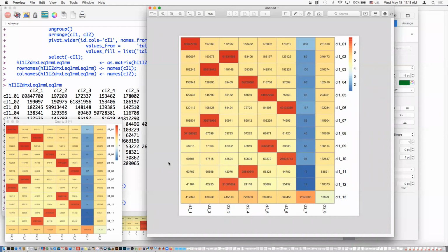It means I only know the I1 identity of the sample. That's like knowing only the row number. I do not know the column number, which means that in a demux analysis of I1 alone, what goes out in a demux pile is the entire row, right? The entire row for, no, I'll point to this one. This is number 12, right? So this is the 12th I1.